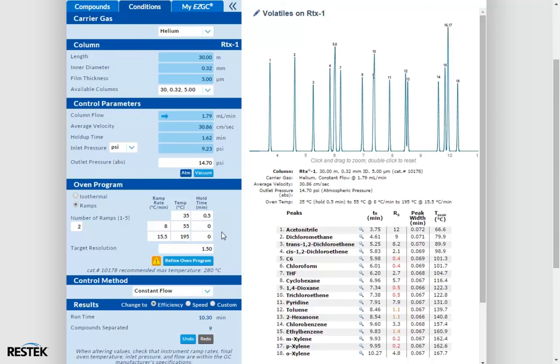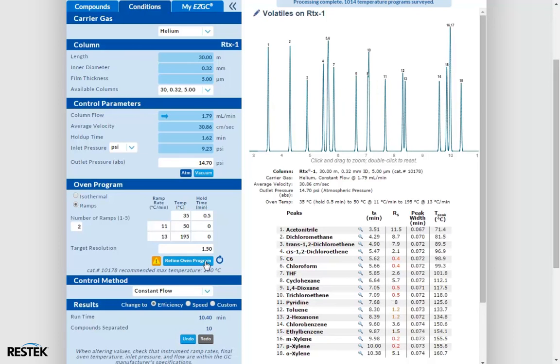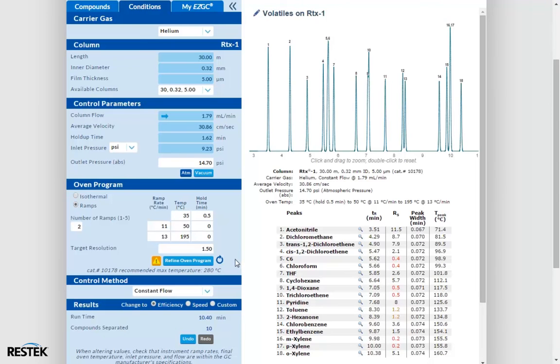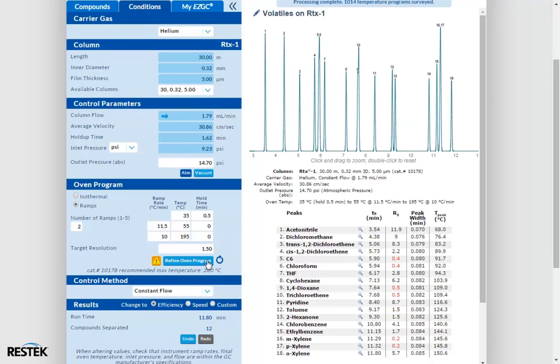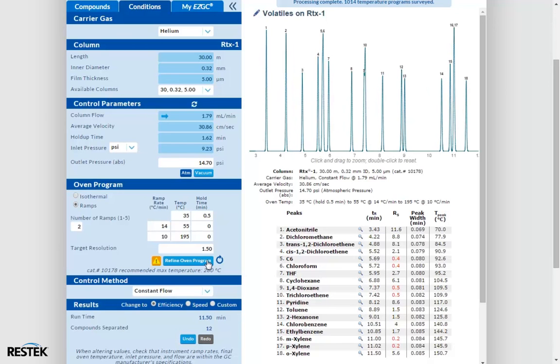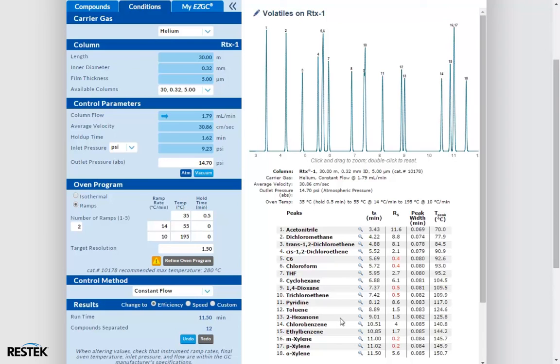Because we changed our flow and elution temperatures, the refine button is highlighted again, indicating that more optimization is possible. Let's see what happens. We take a look at our resolution here, we can see that it got a little better. So let's try to refine until we cannot refine any more and see how good we can get our resolution.